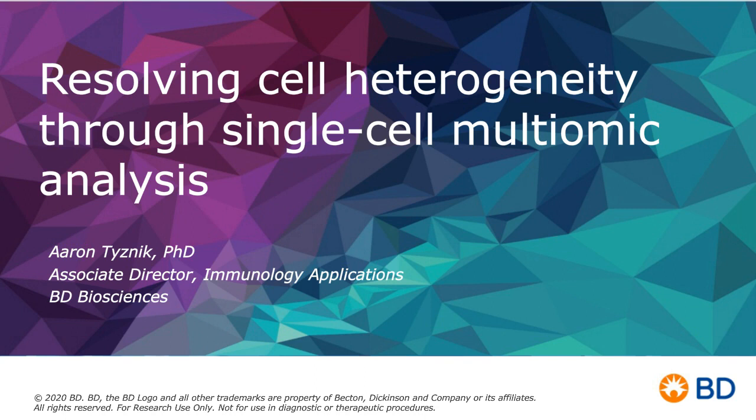As Mahi mentioned, I am the leader of the immunology applications team at BD Biosciences. And today, we will be talking about resolving cell heterogeneity through single-cell multiomic analysis. For those who aren't familiar with multiomic analysis, multiomics is essentially the generation of biological data and analyses of multiple omes simultaneously, whether it's the genome or the transcriptome.